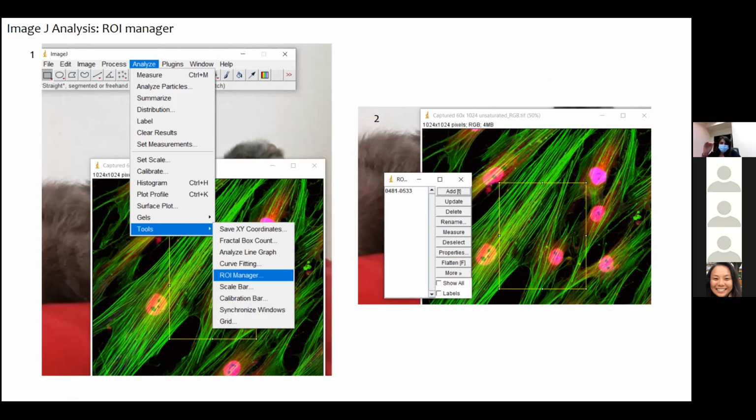When it comes down to imaging, reviewers are very skeptical, and your images need to be backed up by a quantification of these images and by other molecular or biochemical experiments. So just having a paper based on images is very hard to sell because there is a lot of room for manipulation when it comes down to imaging.